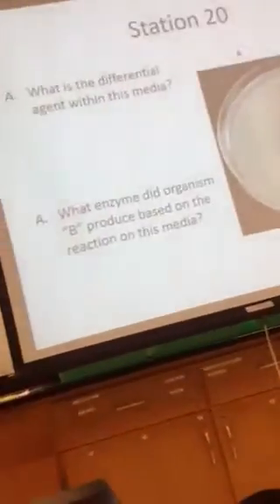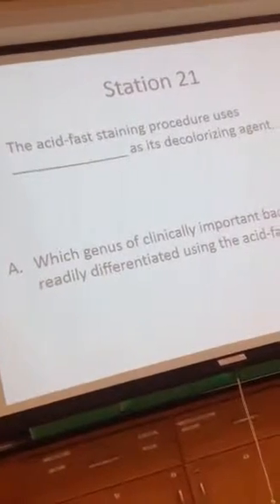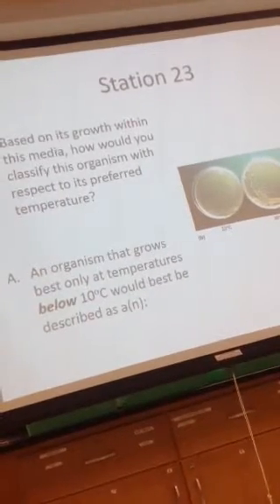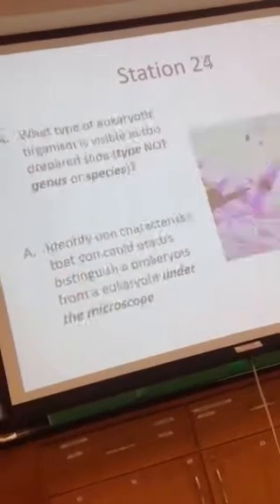You don't have to worry about this one or this one. We haven't done the acid fast stain yet, so you don't have to worry about it. And we've got some stuff to pick up, but these three you don't have to worry about.